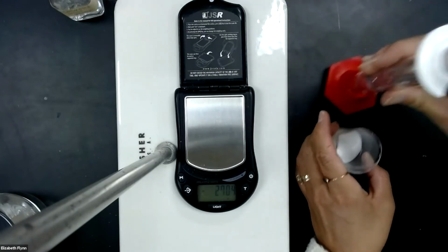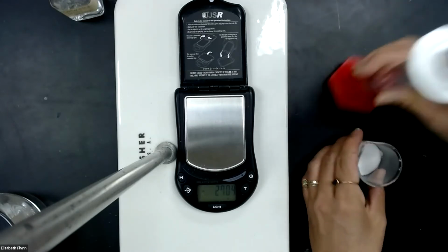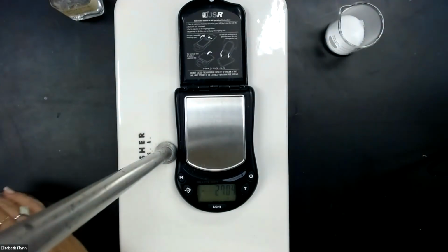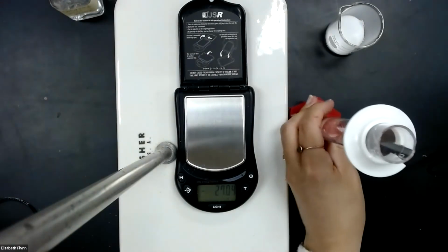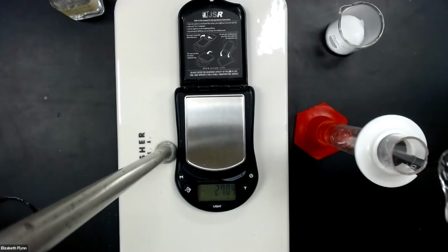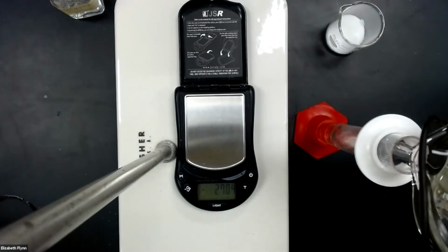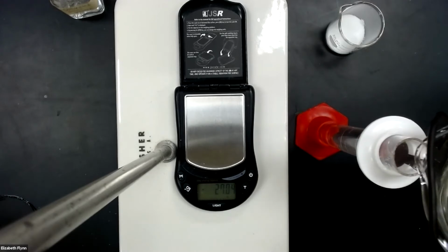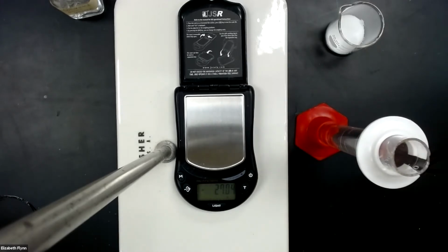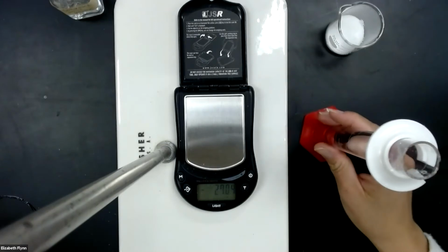So what I'm instead going to do is use my 50 milliliter graduated cylinder, making sure to measure out 40 milliliters of water. 40.0.